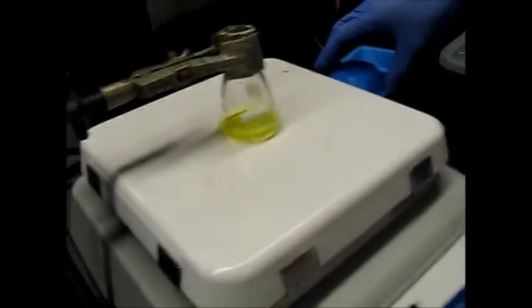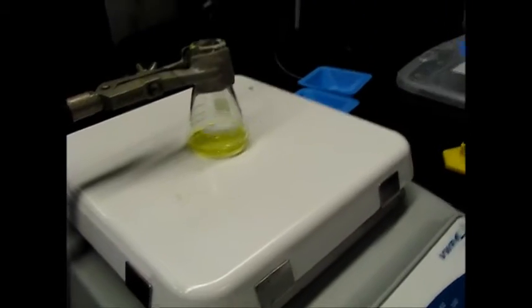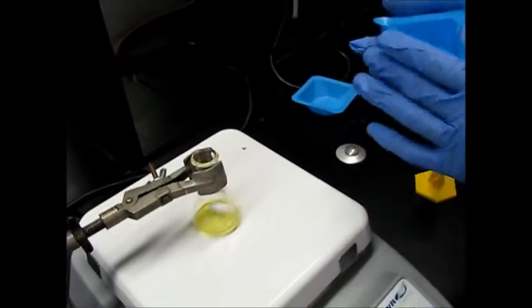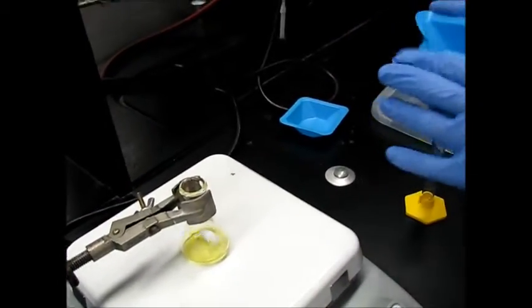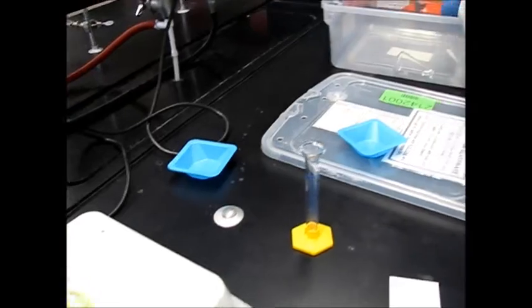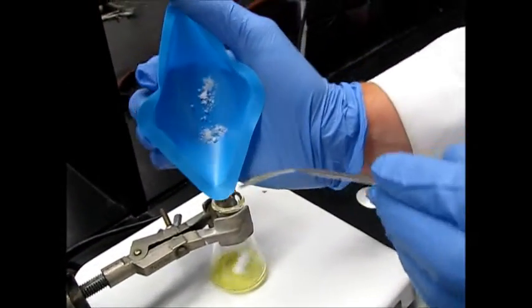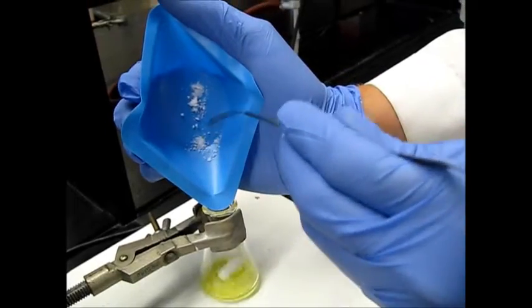So next we're going to add our 50 milligrams of sodium borohydride. So like I said, this stuff is kind of sticky. So I'm going to go ahead and try to scrape out anything that doesn't just come out with this spatula here.